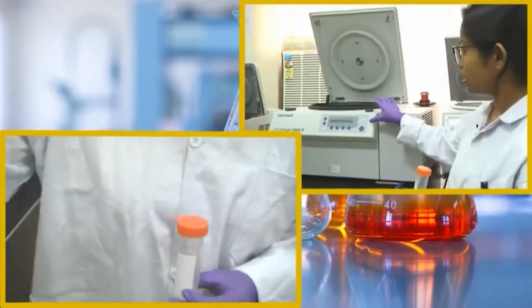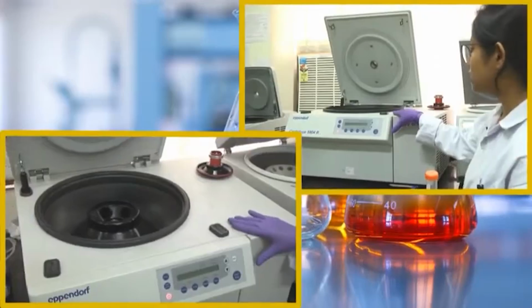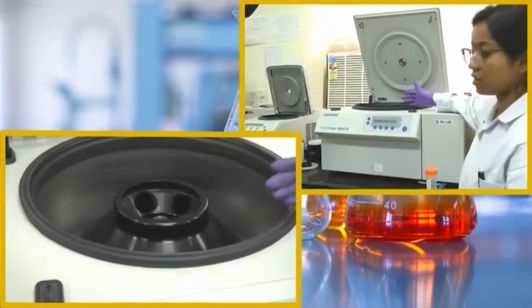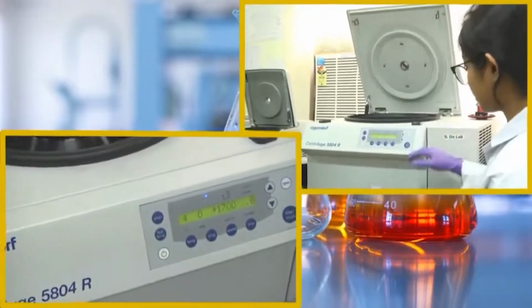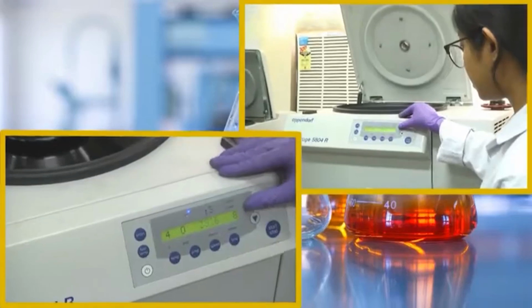So, we will use a big centrifuge machine for this, and this is a high speed rotor. This machine can have a low speed rotor as well as a high speed rotor. So, we will switch it on and we will make the speed highest.